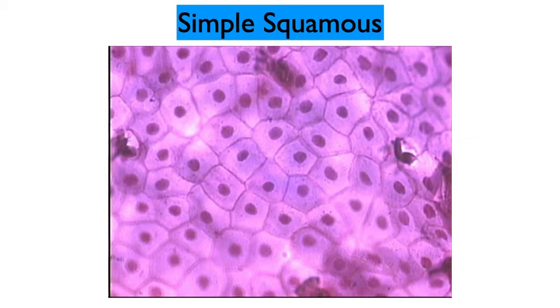And here in this particular slide, you can see we're looking down upon the cells. They look irregularly shaped. They look like pavers that are linked together, forming a walkway. And you can see the central nucleus very evidently. In some of the slides you looked at, though, you would have seen this from a side view, and you would see why they're called simple squamous. They're very, very flat. Their job is to allow easy diffusion of materials into and out of those cells. So they act as a barrier, but they want to allow things to move in and out.